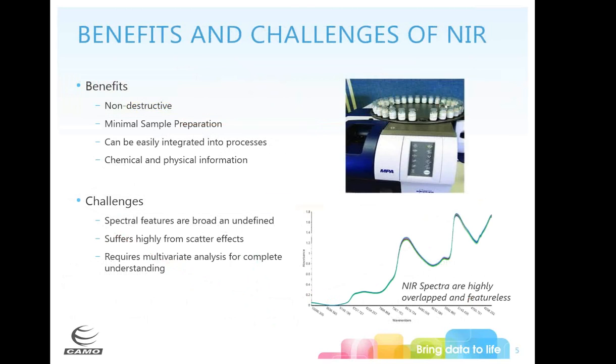All right, so some of the benefits of using near IR is it is non-destructive. You don't have to really do much sample preparation, if any. It's very easy to integrate into your process, and it contains both chemical and physical information.